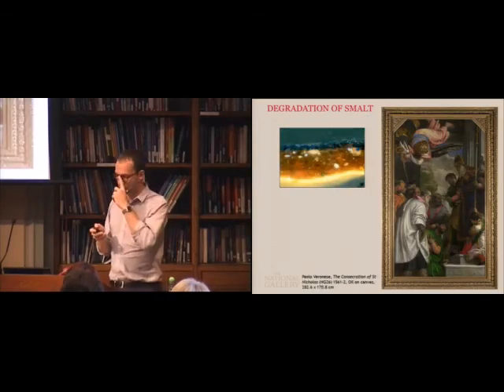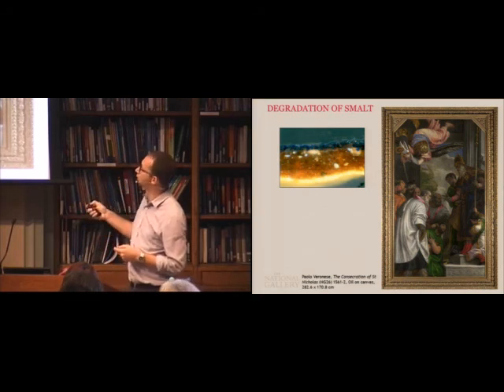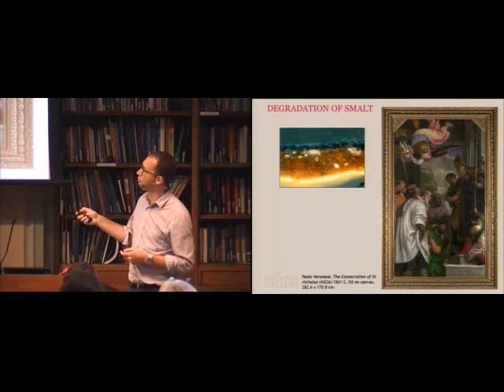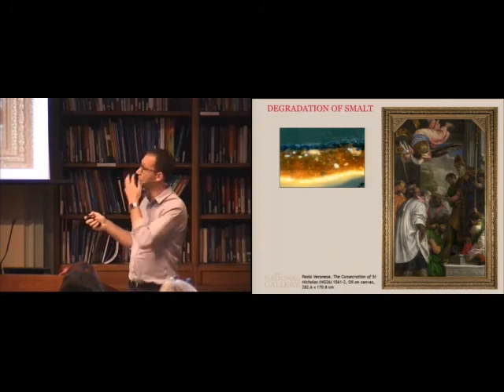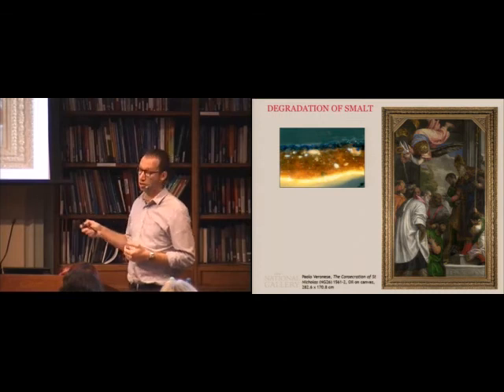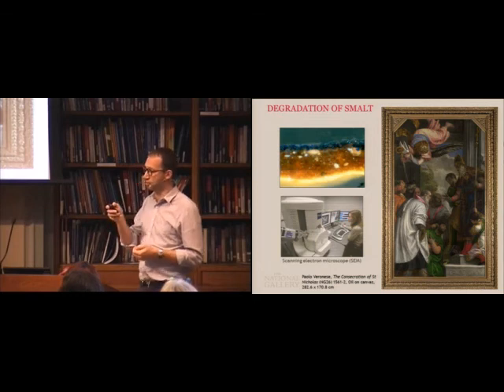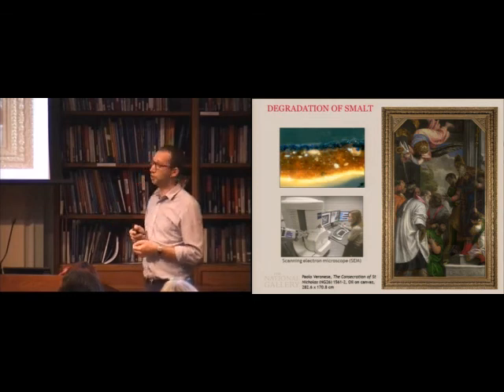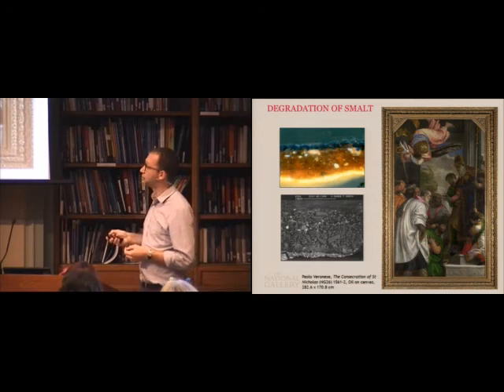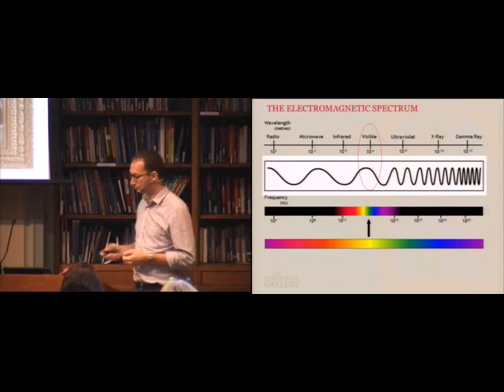And I just wanted to show you that the same thing happened in this example. It's not so obvious because his blue coat, the highlights are all in ultramarine and they haven't changed colour. But this underlayer would have all been blue. So this brown mush is actually smalt. And if you don't believe me, we've got a scanning electron microscope in the department. And when you look at that cross section under the SEM, you can see it looks like broken glass, because that's exactly what it is. It's ground up, broken up glass, but it's now reacted to form this mush.